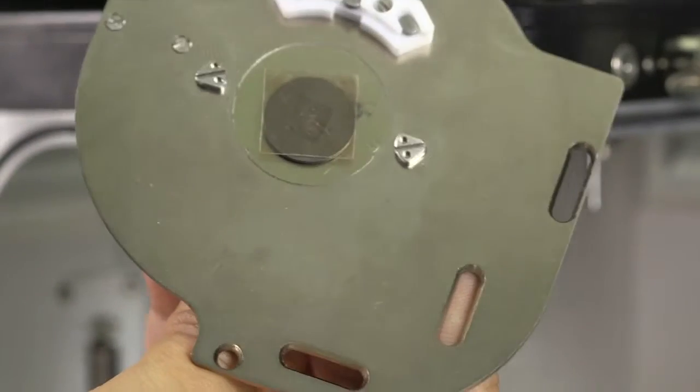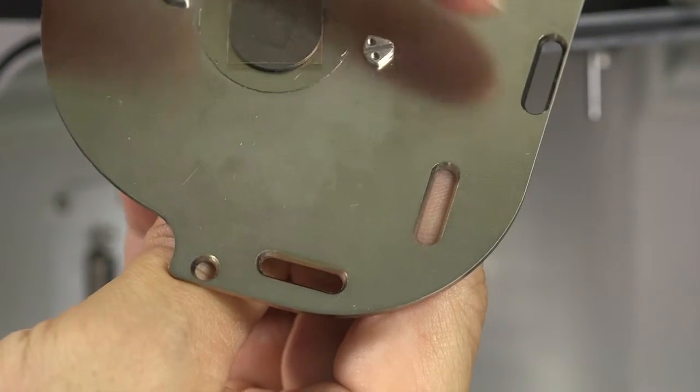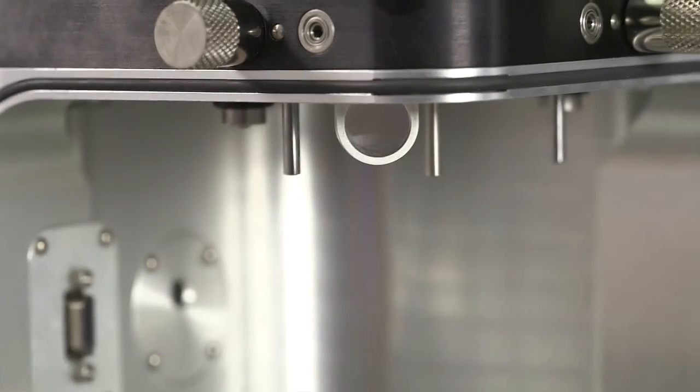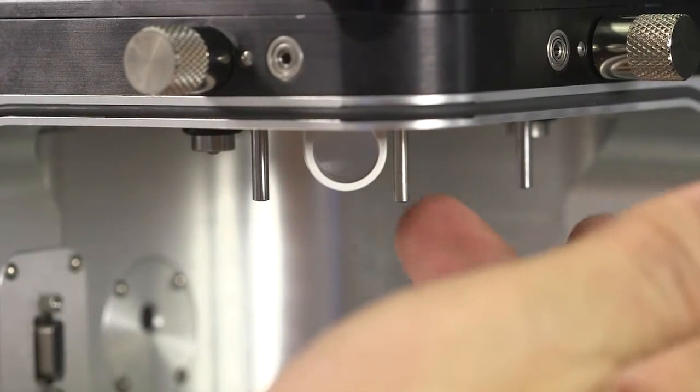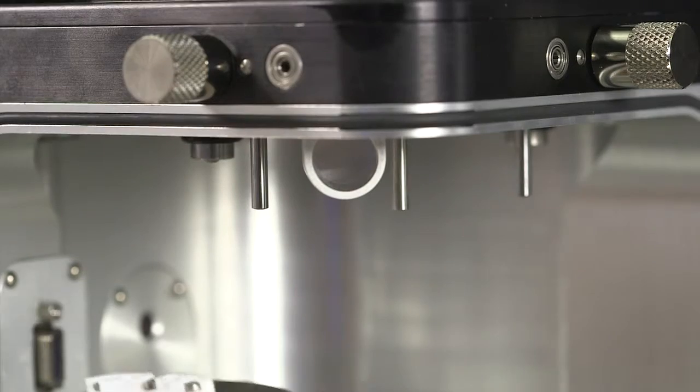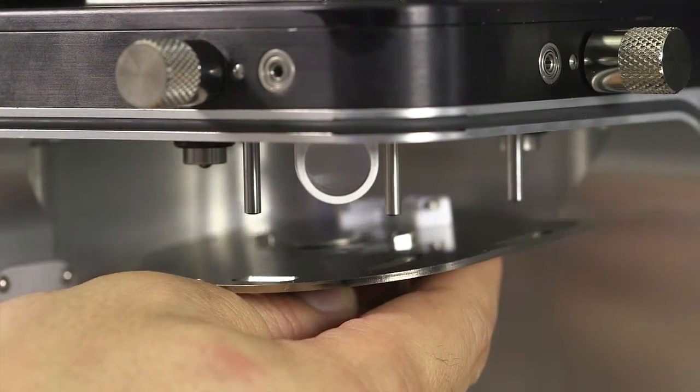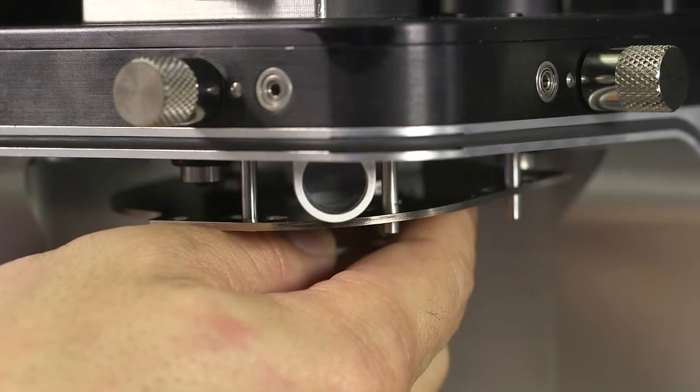There are three slots cut into the sample mounting plate, and there are three location pins in the AFM head. Make sure the three pins go into the three slots when you mount the sample plate to the AFM head.